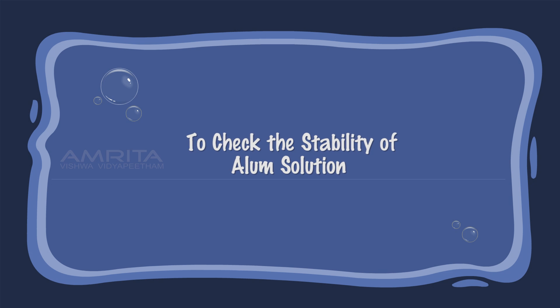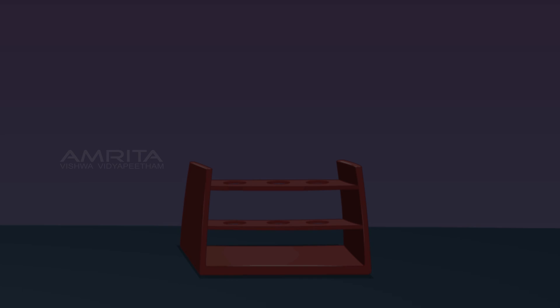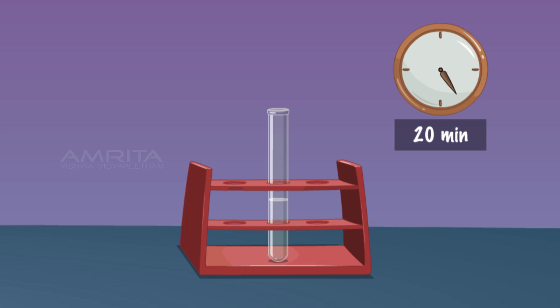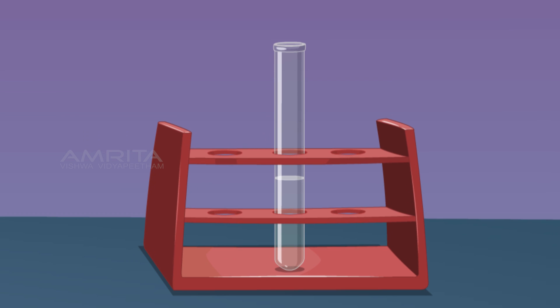To check the stability of the alum solution, take some alum solution in a test tube and leave it in the test tube rack for 20 minutes. The solution remains as it is without sediments. This indicates that true solutions are stable and do not show component deposits.